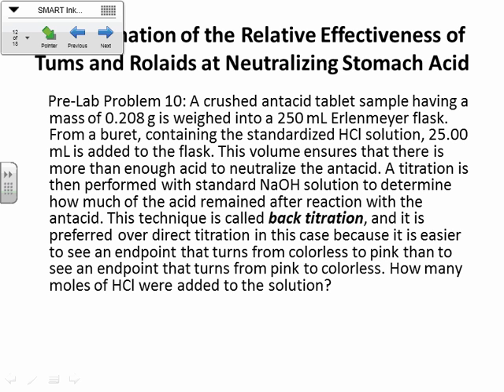Now, I might change this part again. I think I changed this for some of you in part 2, where I said I will get you a graduated pipette where you can measure 25.00, or a volumetric pipette or something. Or, just thought about this, I've got an extra buret in the middle. Maybe that could be the official buret to measure out your 25 milliliters of the HCl.